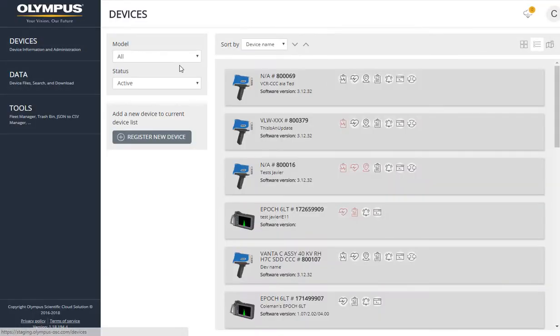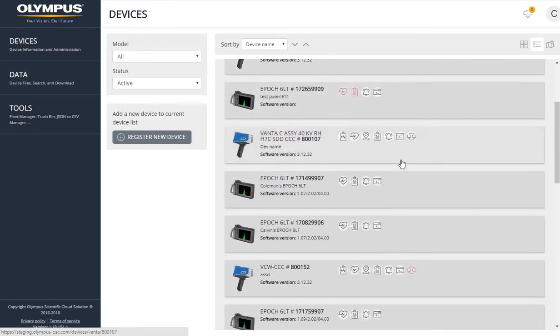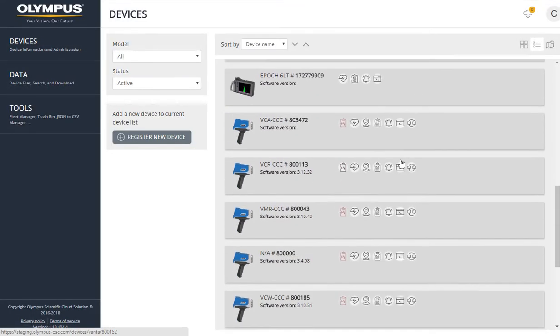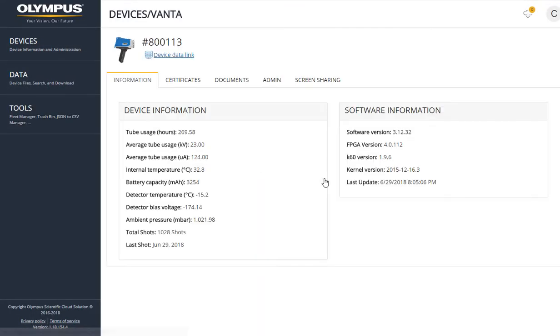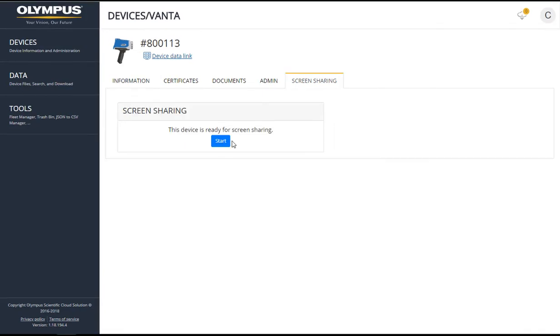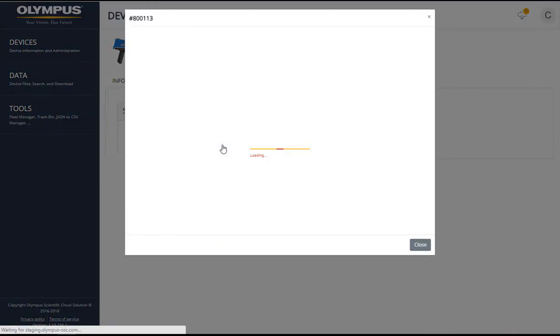From the Devices tab, select your instrument. Select Screen Sharing and then select Start.